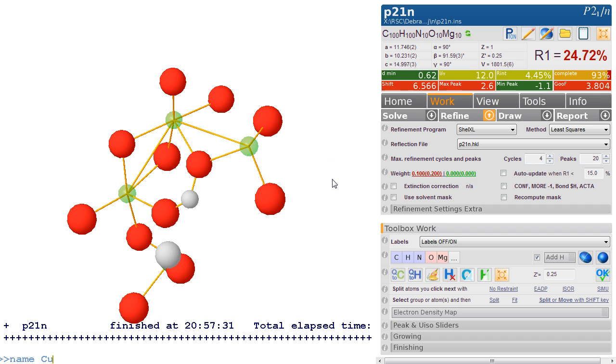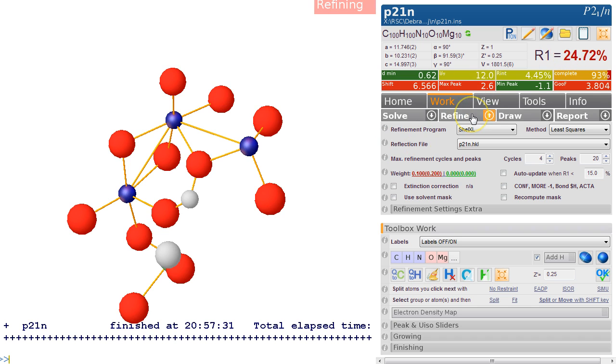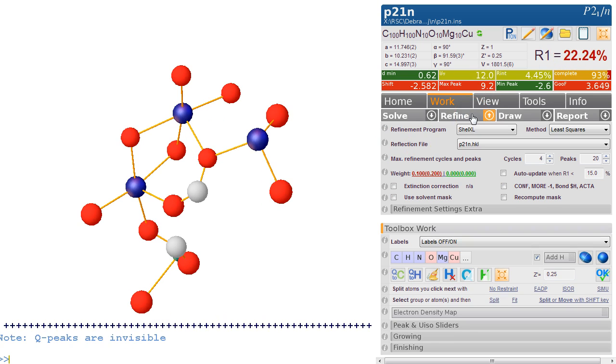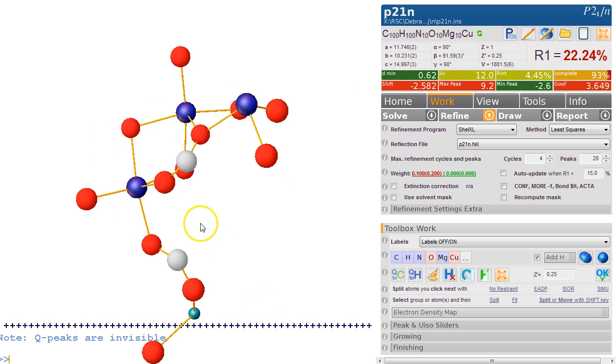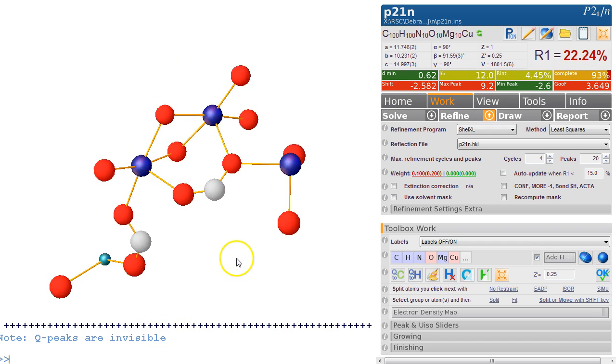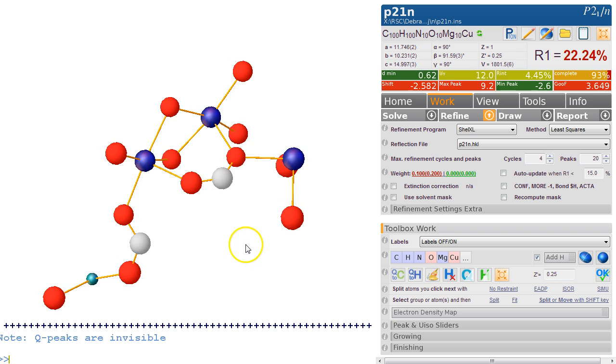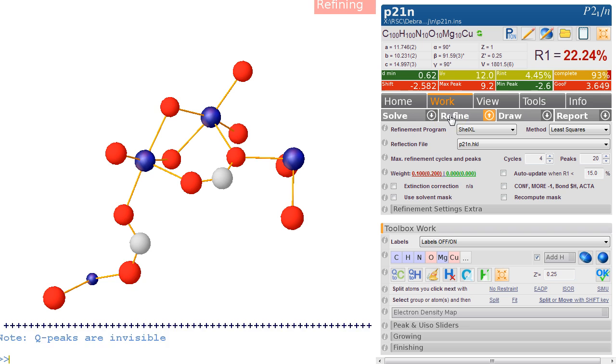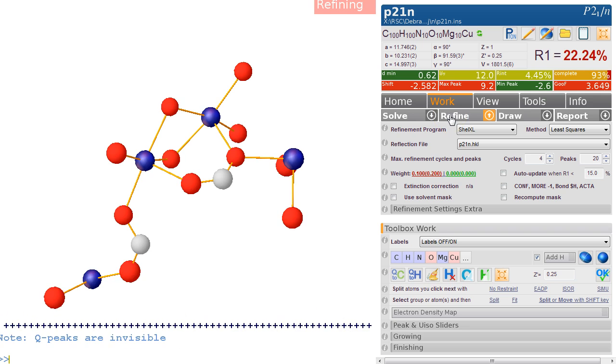The R factor is 24%. If you refine that, let's see what we get. Oh, that looks a lot better. The R factor is 22%—not great, but things are starting to look a bit better. Now this one we forgot, so let's make this a copper as well and refine this.